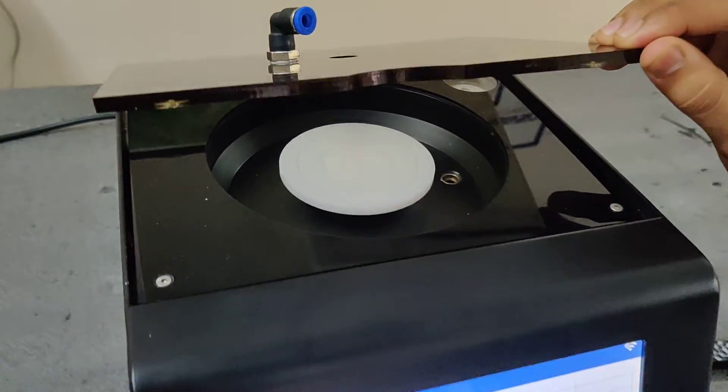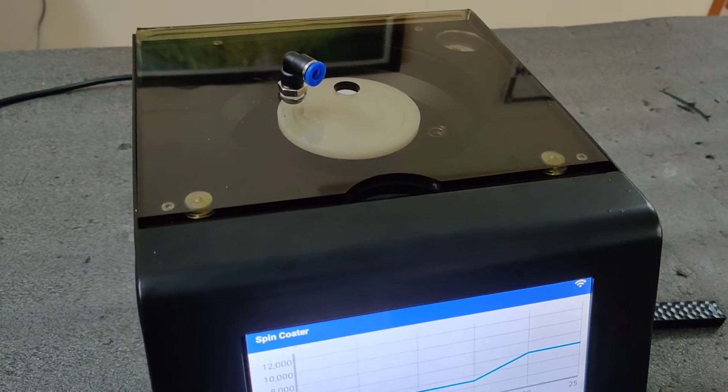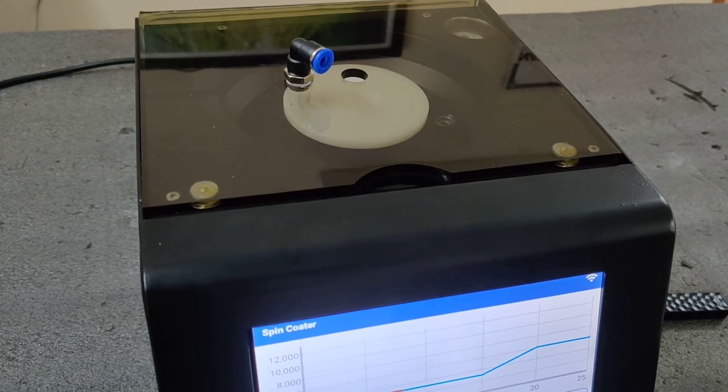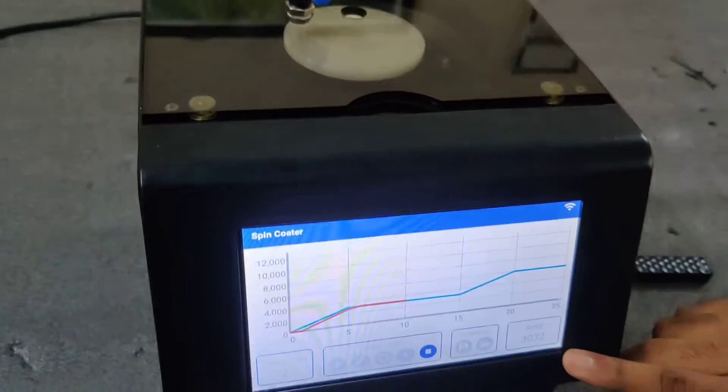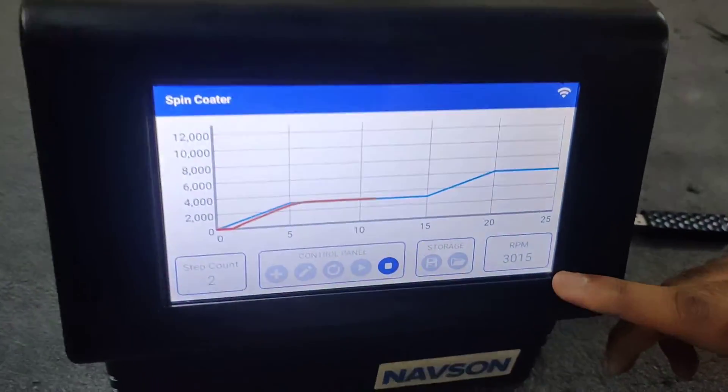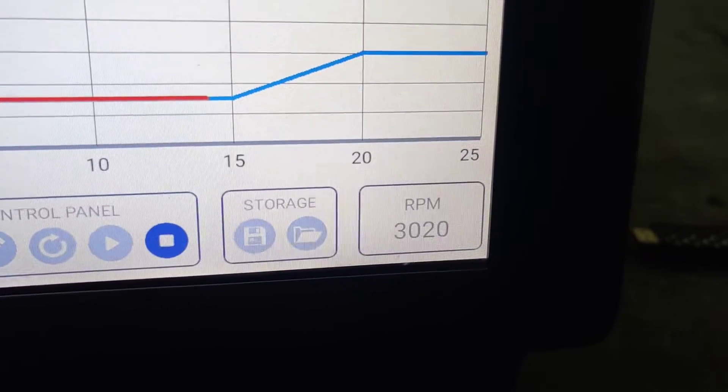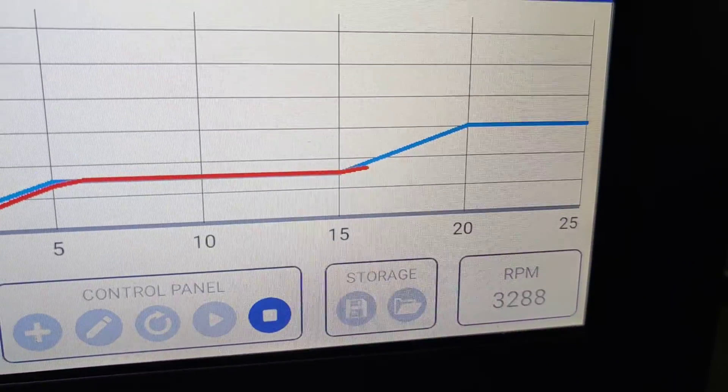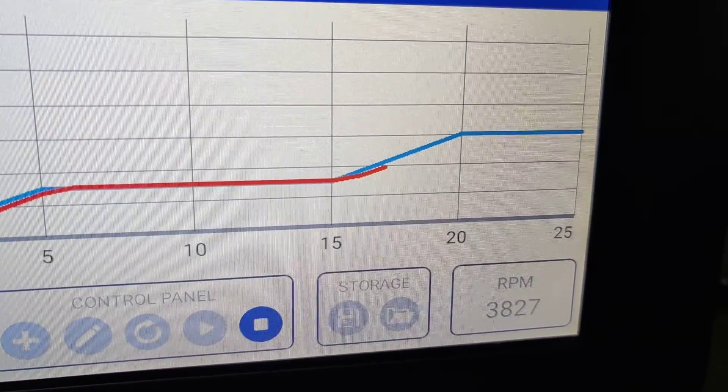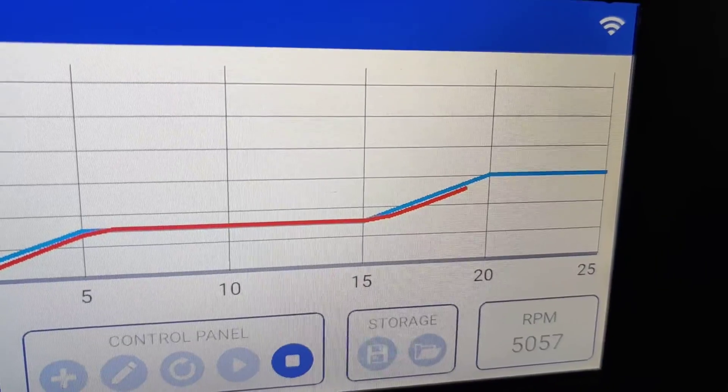Close the lid. So this is the live RPM feedback that you will be getting and a line traces along the path of the set line.